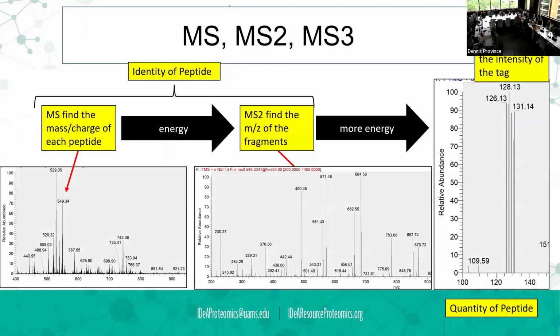So again, short question. Yes, sir. So on a 10-plex, does it mean like 5 replicates of a control and 5 replicates of a treatment? That would be 10-plex? That would be it. That's right. Thank you.